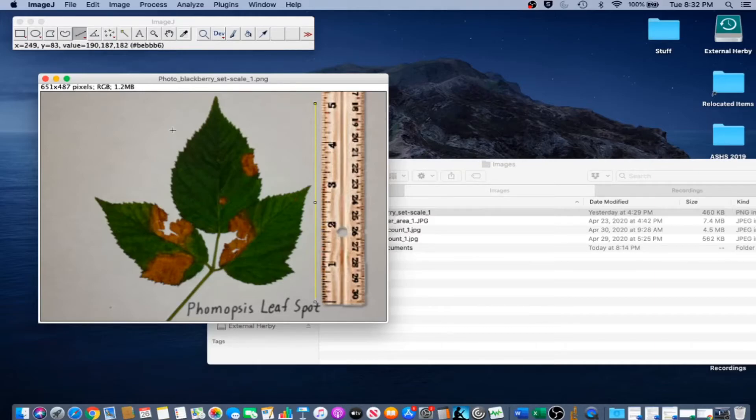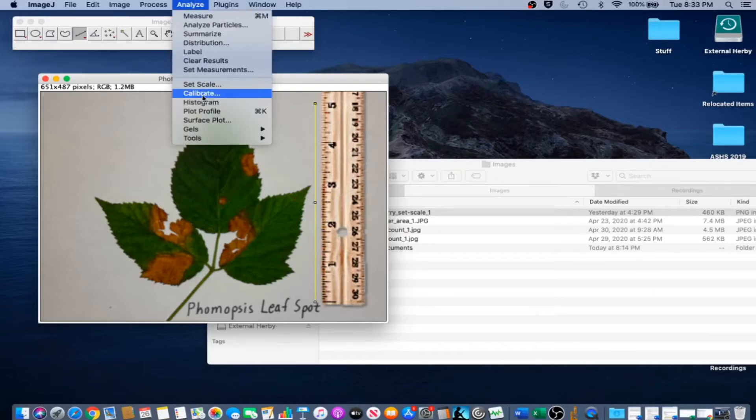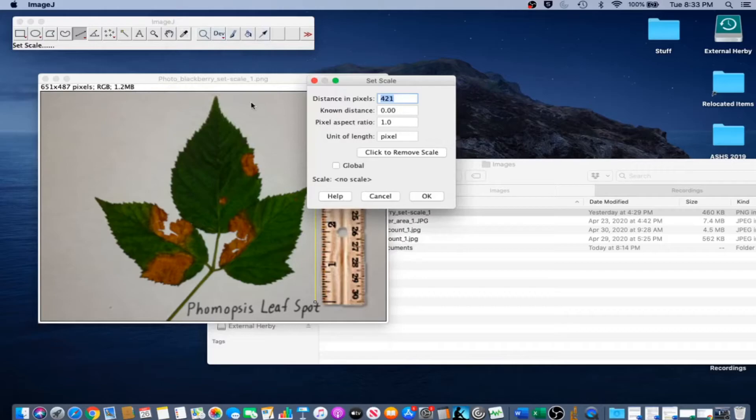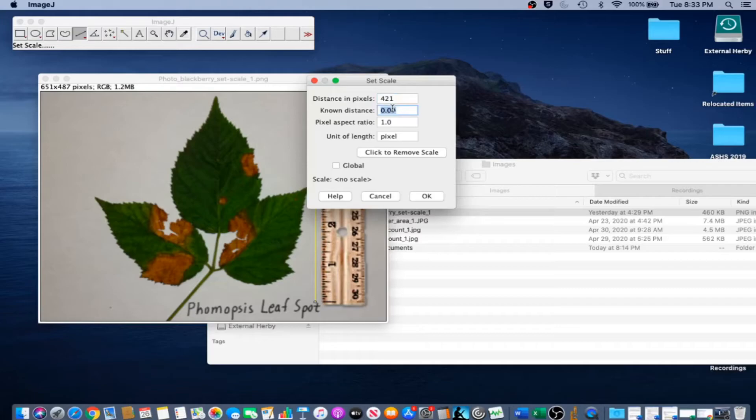Go to Analyze Set Scale. To set the scale of the line you just drew to 5 inches, change the known distance to 5 and the unit of length to inch. Notice the global box as well.